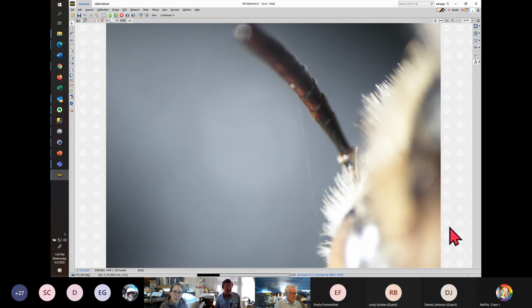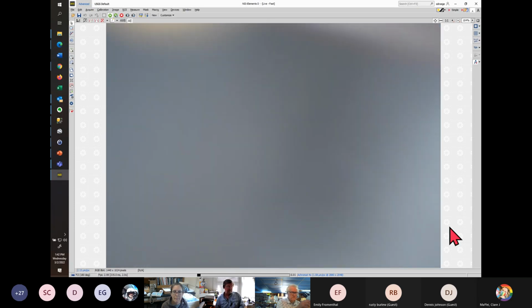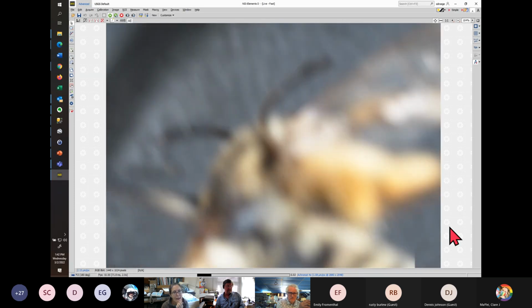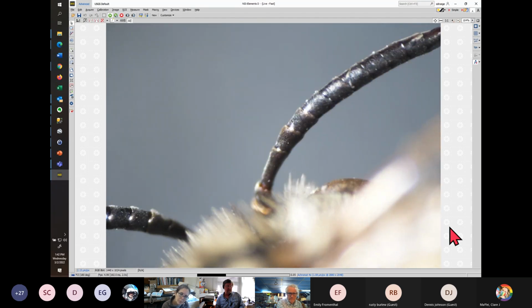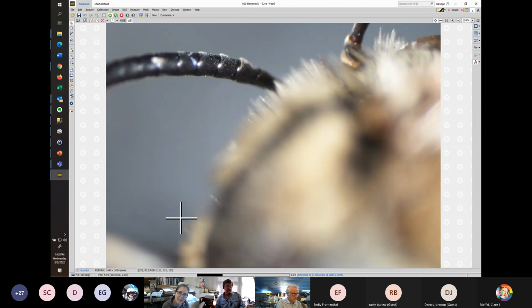Yeah, hard to see. But if you put your cursor on F2 there. Okay, you want the underside of F2? Yeah, F2. Okay. Yeah, I think it was easier to see from the angle before because it's hard to see that light color.